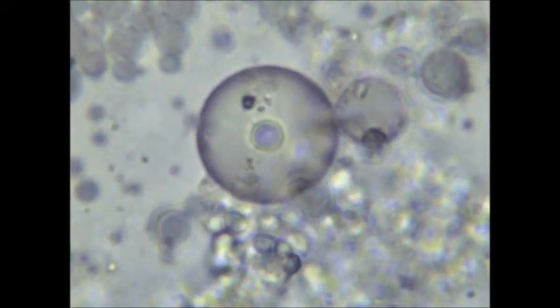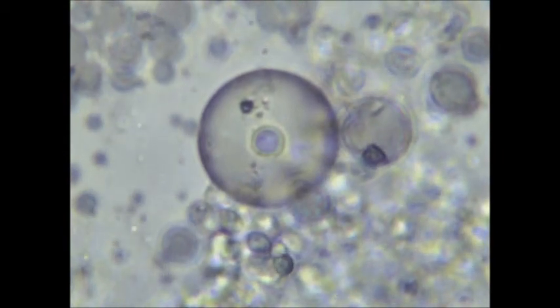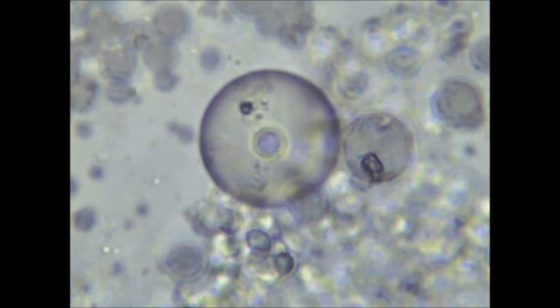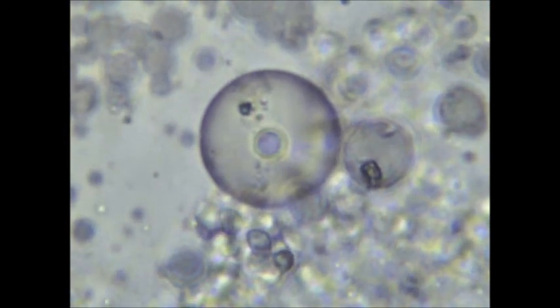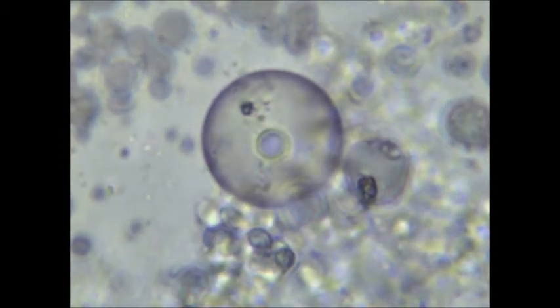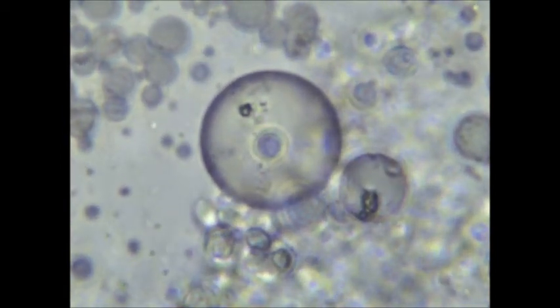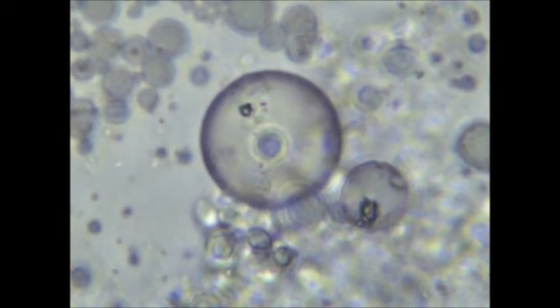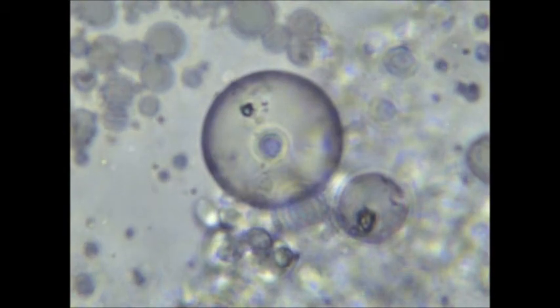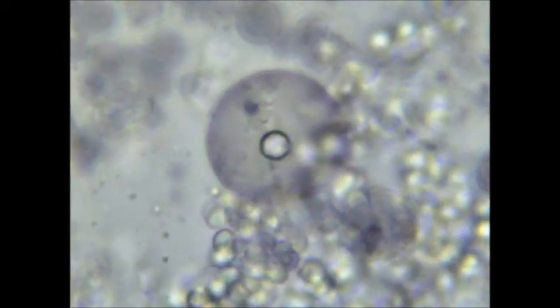I added the RNA solution to the fatty acid solution and I proceeded to expose the vial with the mixed solutions to two heating and cooling cycles, where I placed the vial in boiling water for five minutes and then put it in the refrigerator for several hours to cool it down. I repeated this process again and then I put a few drops of the resulting solution under the microscope at a thousand times magnification.